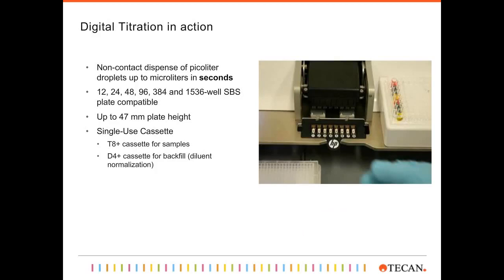Now, there's a small video going to play that shows how the workflow is with the D300E, how the fluid is put into the dispense head and then how the dispensing subsequently happens into the assay plate underneath it. So if you could please play the video.